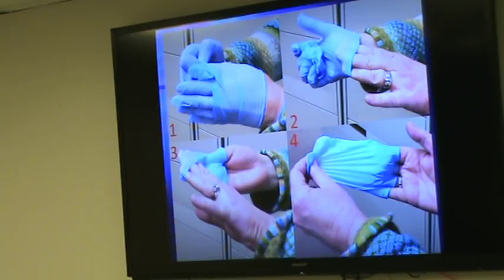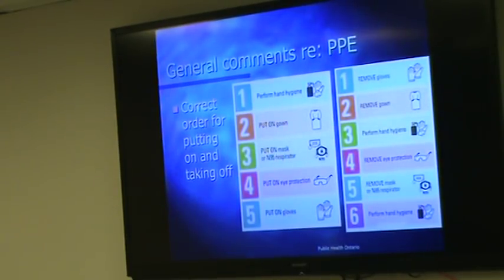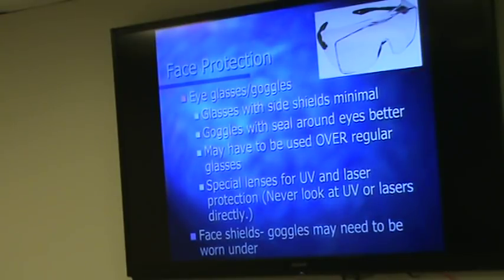There are similar things for how to take off lab coats, and CDC has something similar to this. So if you are in a situation where you need gloves, gown, and so forth, try to put those on in the proper order, and the gloves have priority over almost everything because typically that's the dirtiest part of you, where you've been doing the work that you've been doing.